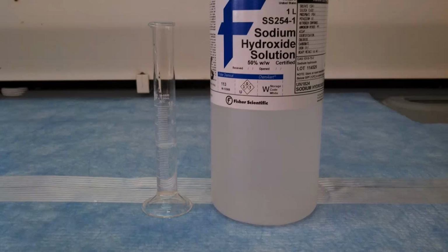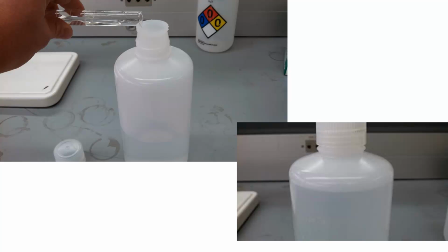So to make your titrant in this case, your titrant is going to be sodium hydroxide, and we're going to start out with a 50% weight by weight solution of sodium hydroxide. Whether we start with this solution or if we started with solid sodium hydroxide, either way, it's very difficult to control the amount of sodium hydroxide that we actually put in to our titrant. So you're going to measure out, not too exactly, about 5.2 milliliters of sodium hydroxide. And you're going to add this to a 1 liter Nalgene bottle.